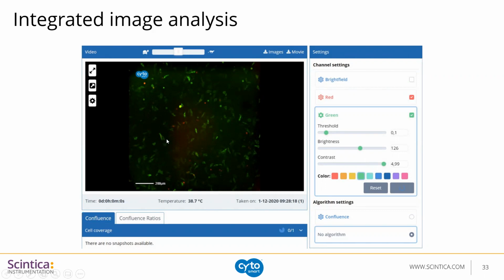And then you can actually export your video files and images right here from the cloud. So up here, you see the turtle over here and the cheetah. This is going to be regarding the speed of your video. So you can choose to either trim the video if there's only a certain part you want to use for a scientific presentation or a publication, or you can show the whole thing, but maybe you want to slow it down to a certain part or speed it up. So these are all options, and they're all integrated within the image analysis. And like I said, super user-friendly for beginning trainees.